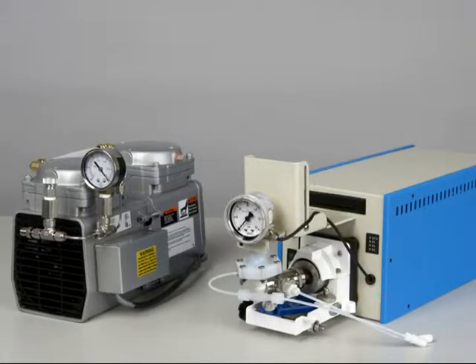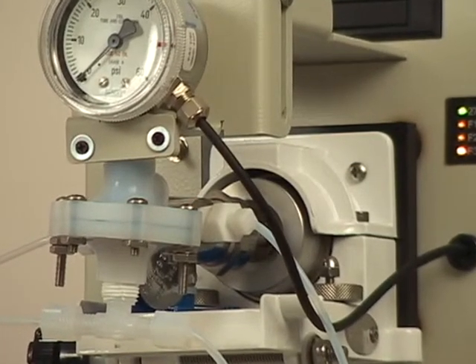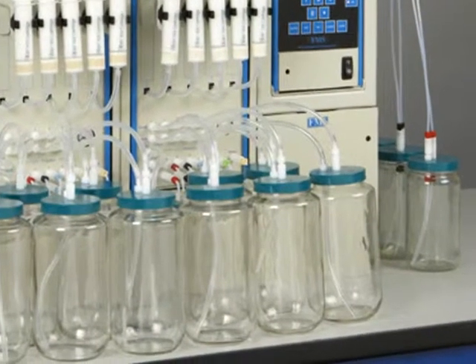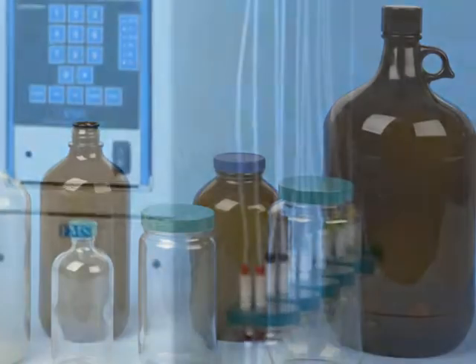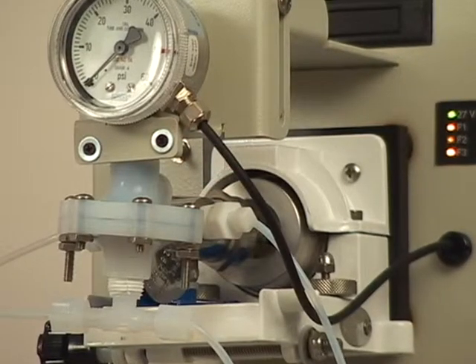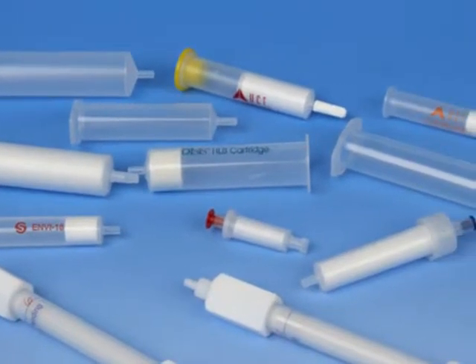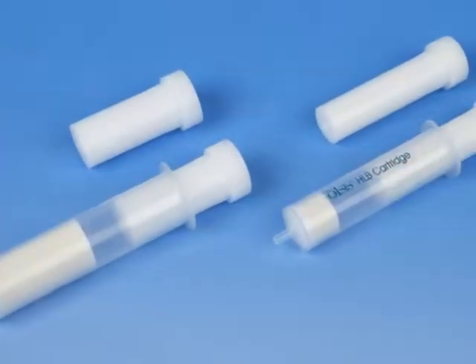The PowerPrep SPE system meets regulatory compliance guidelines for SPE method throughout the world that requires vacuum and positive pressure pumping for the accurate, precise delivery of sample, conditioning, washing, rinsing, and elution solvents. A positive pressure HPLC pump accurately and precisely delivers up to six solvents for conditioning, washing, rinsing, and elution. The PowerPrep SPE system design allows for various cartridges, column sizes, and chemistries, giving the end user flexibility to use the same unit for all sample types.